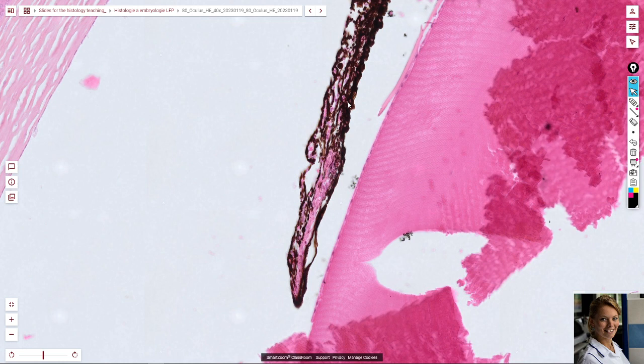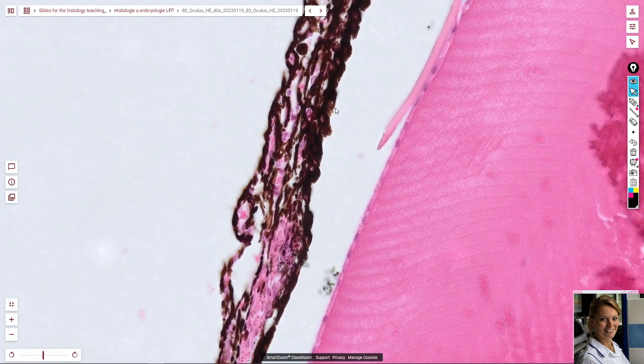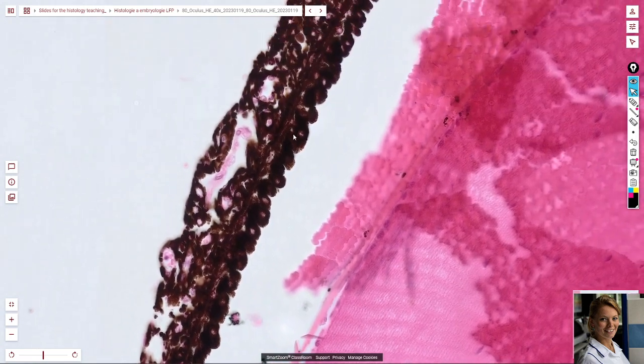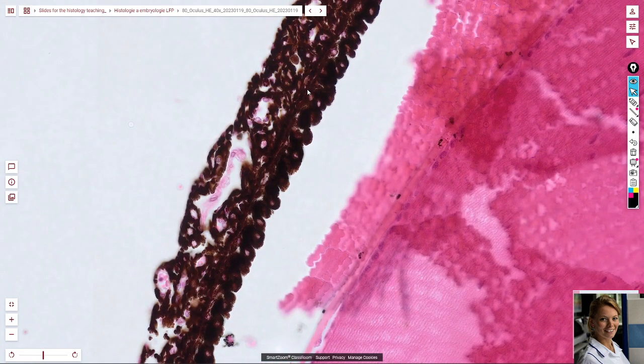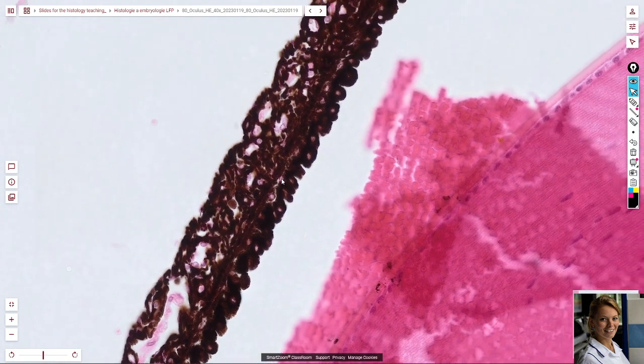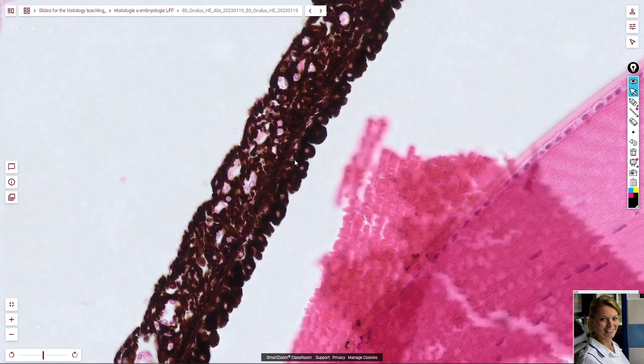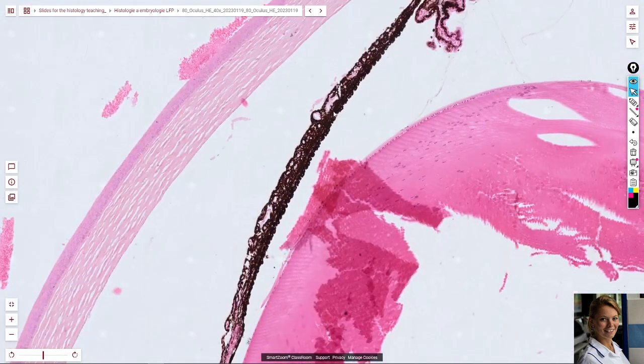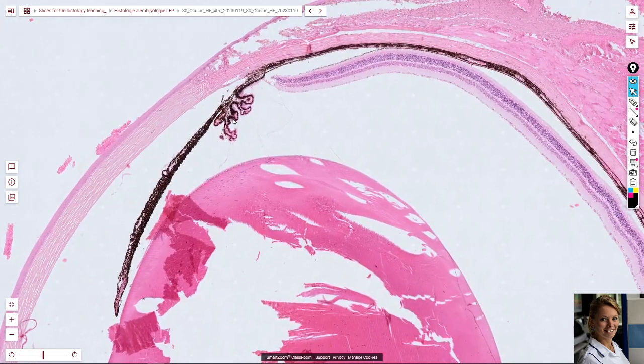Epithelium of iris covers only the posterior surface of iris and is composed of cuboidal pigmented cells here, and the myoepithelial cells are beneath the epithelial cells of iris. But it's not very well visible because there is a large amount of melanin, so it's not clear for description and focusing.